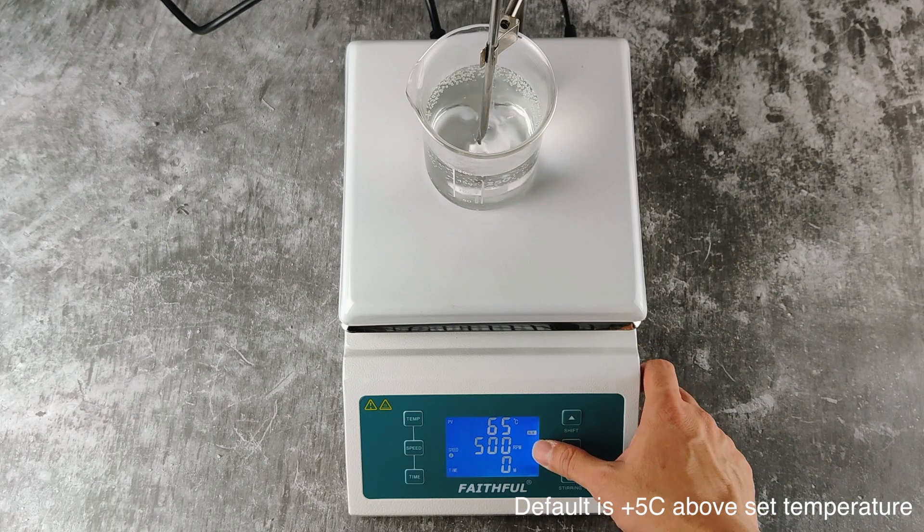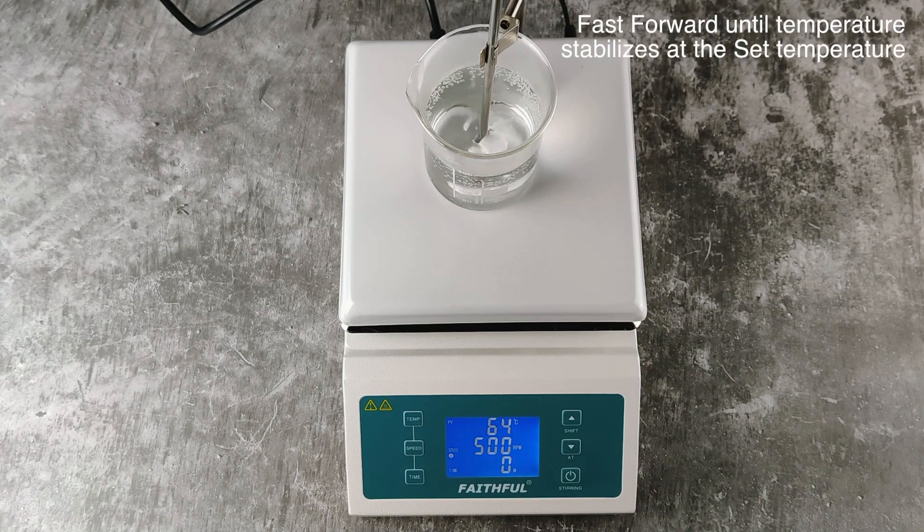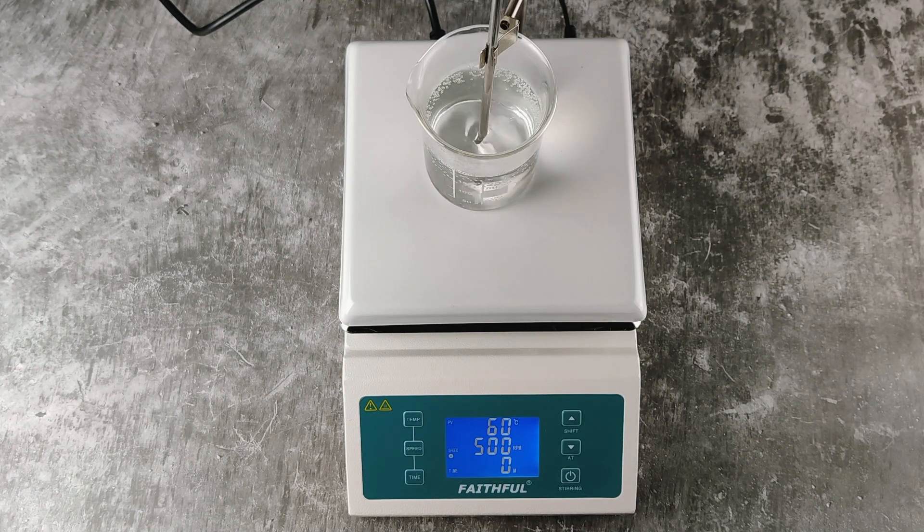If it gets too high, the alarm will ring. The stirrer will now maintain the temperature at 60 degrees.